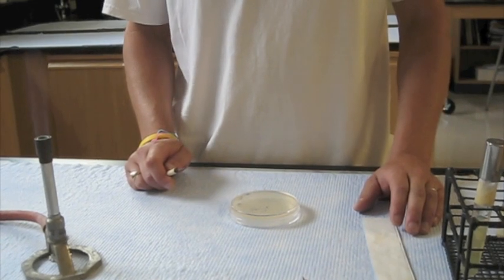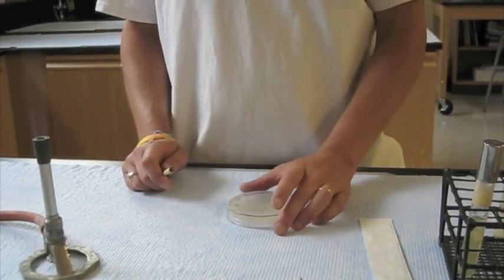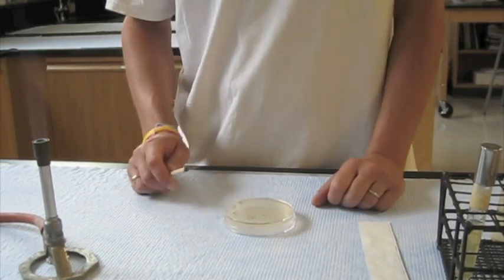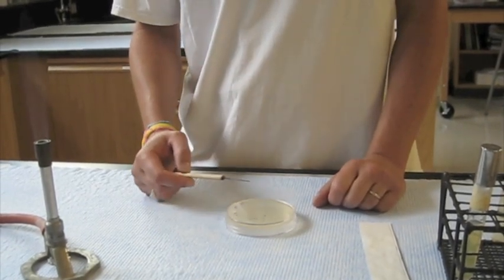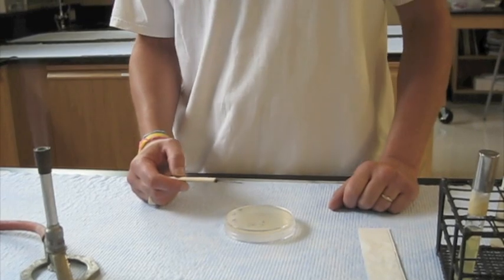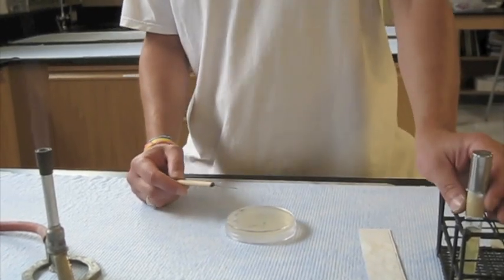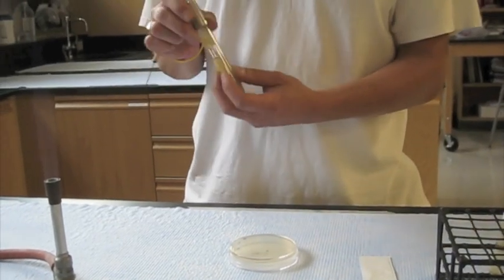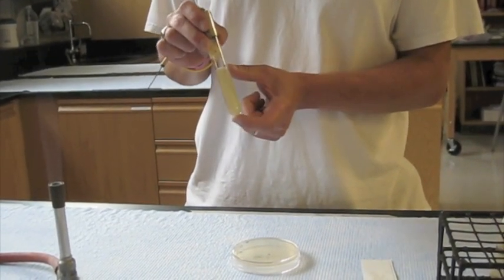In the next segment here, we're going to show you how to do what's known as a stab. We're going to take some bacteria off a plate that has been incubating in the incubator overnight and transfer them using an inoculating needle instead of a loop this time, into a tube of nutrient agar, which is known as a stab.